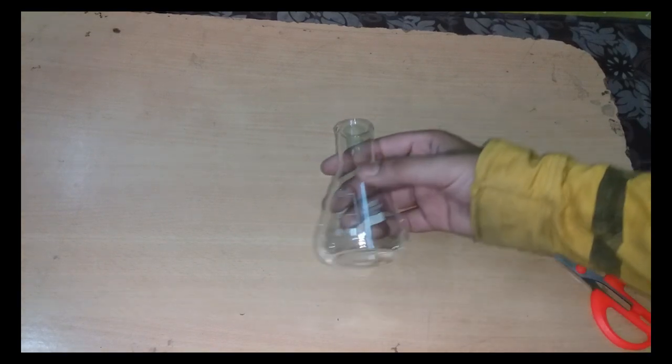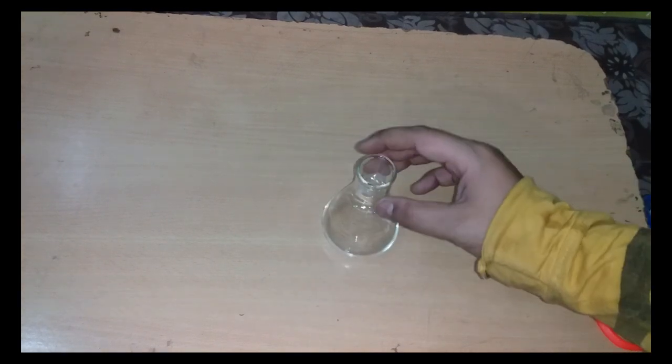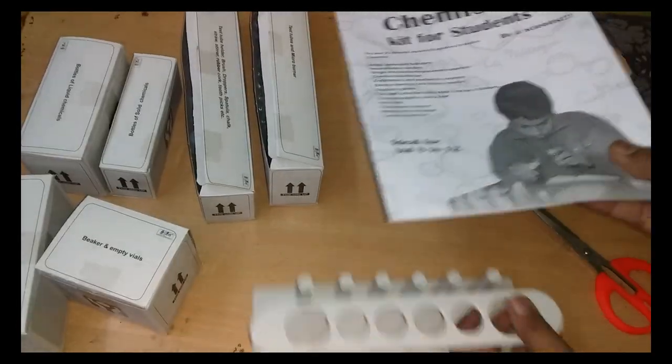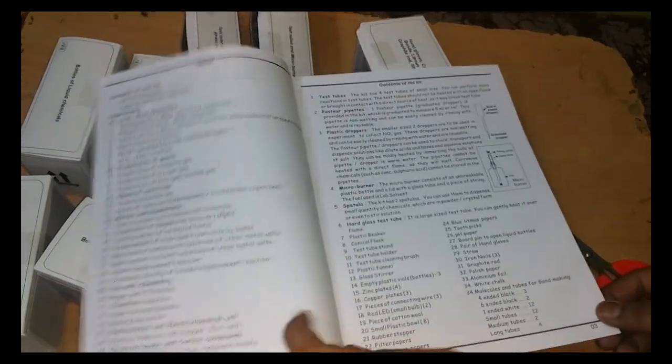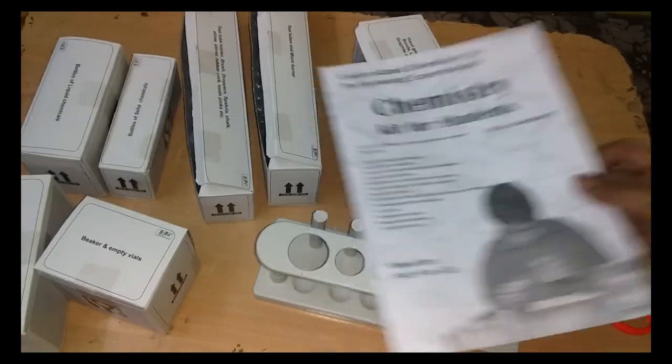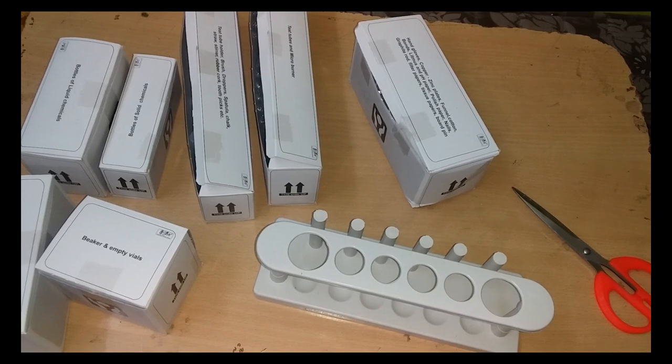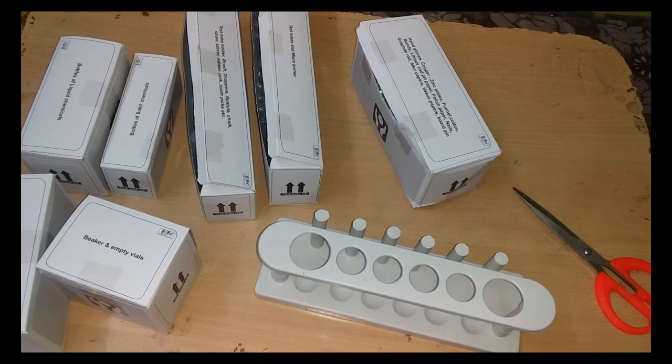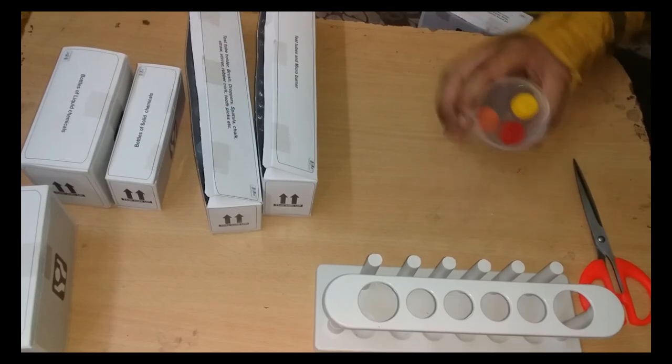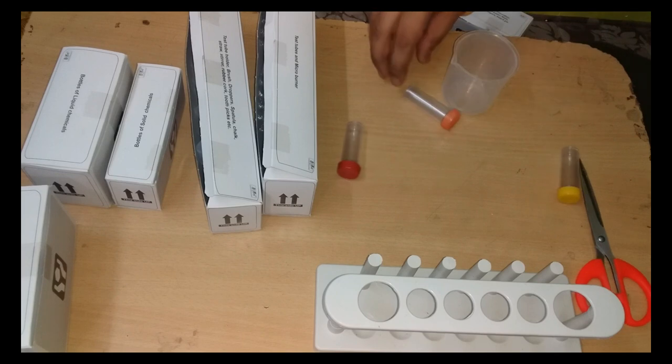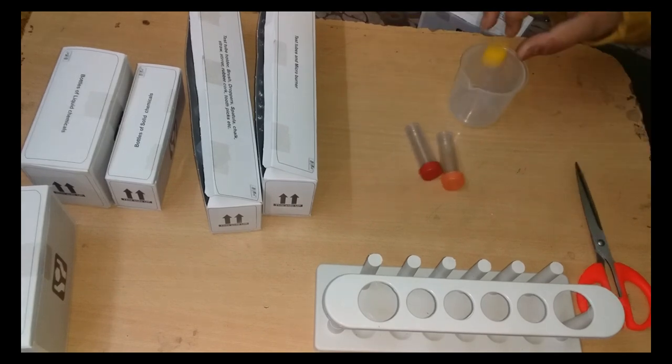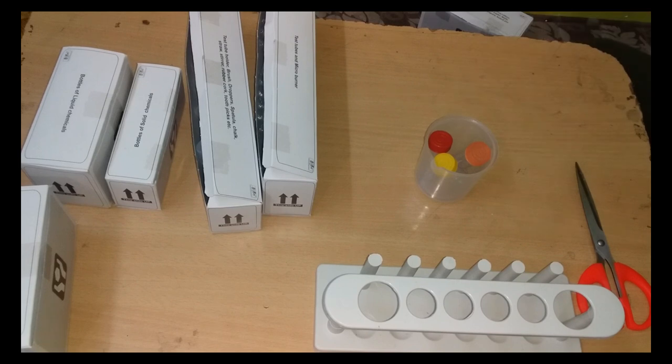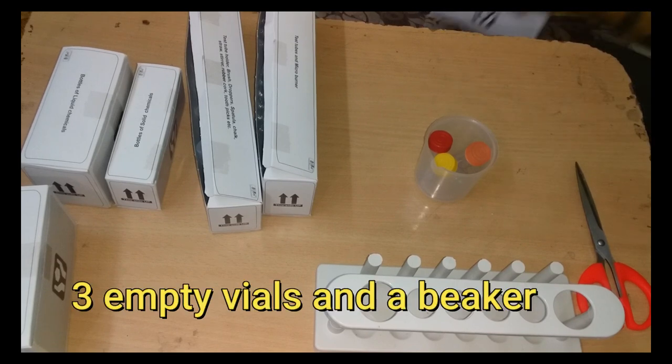This is a 100 ml flask. Now I spent some time cutting all the packets with a bazillion experiments written over it. That's all the packages on the table. This is a plastic beaker with three vials - empty plastic bottles, three empty vials and a beaker.